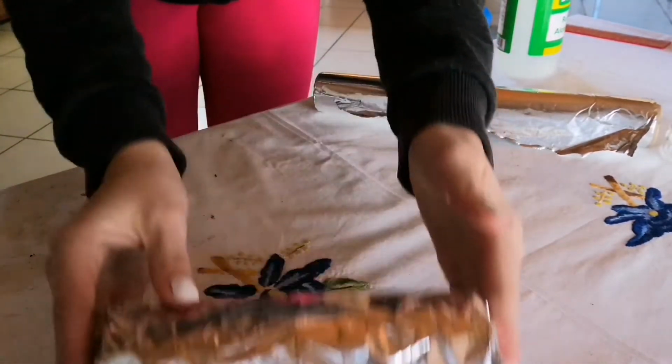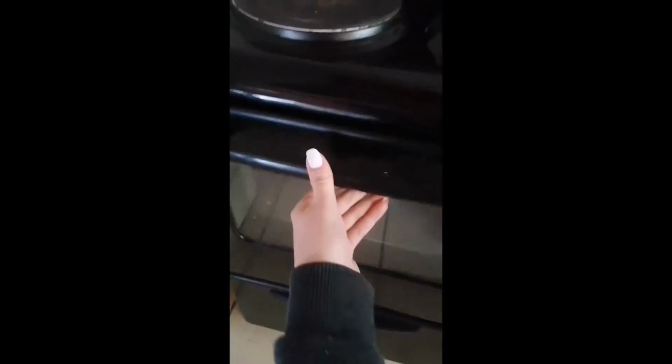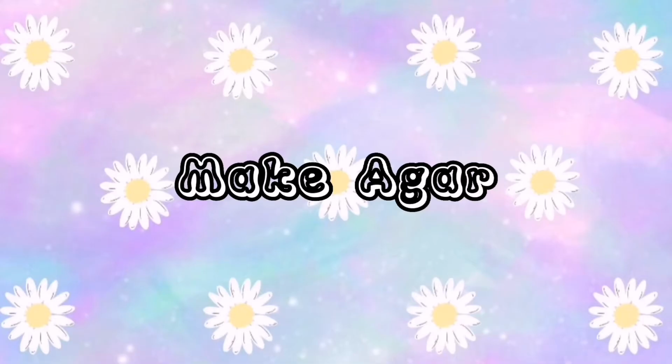Here you can see I've wrapped it up, and now I'm placing the 2 tubes of petri dishes into the oven, and I'm going to let them cook for about 20 minutes. I'm setting my timer so I don't forget. And now let's move on to the next step to make the agar.